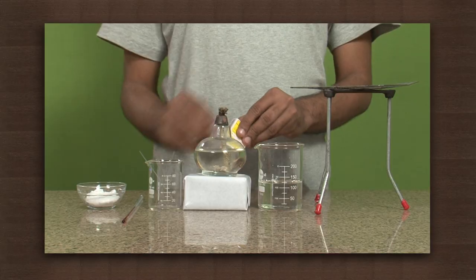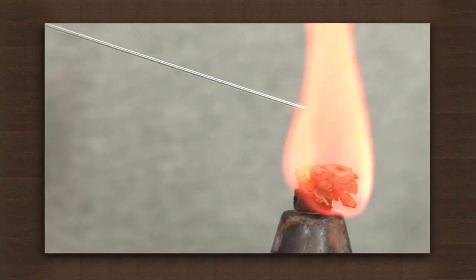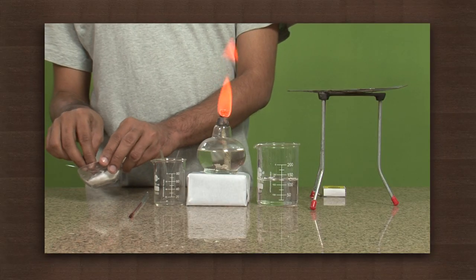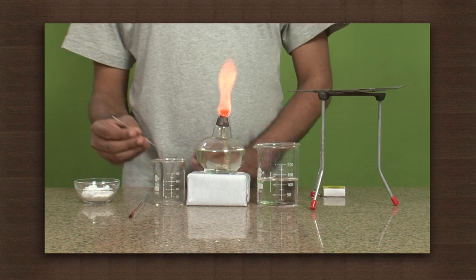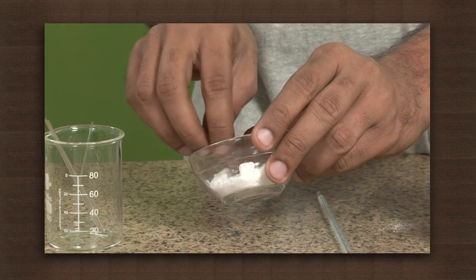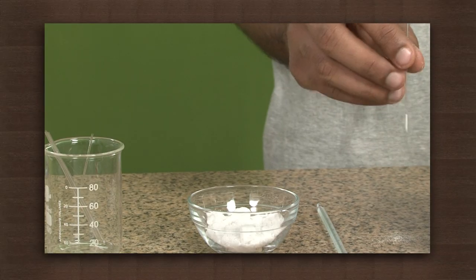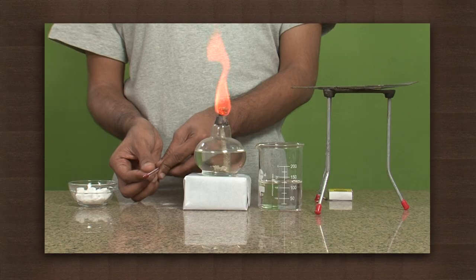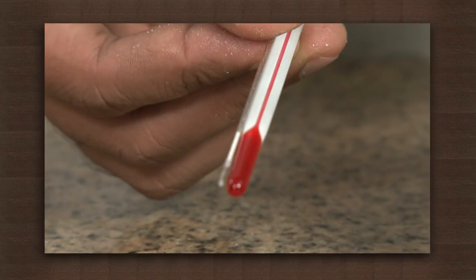Light the spirit lamp and close one end of the capillary by heating. Put some naphthalene powder from the open end of the capillary. Now tie or stick the capillary to the thermometer. Make sure the sealed end is at level with the thermometer bulb.